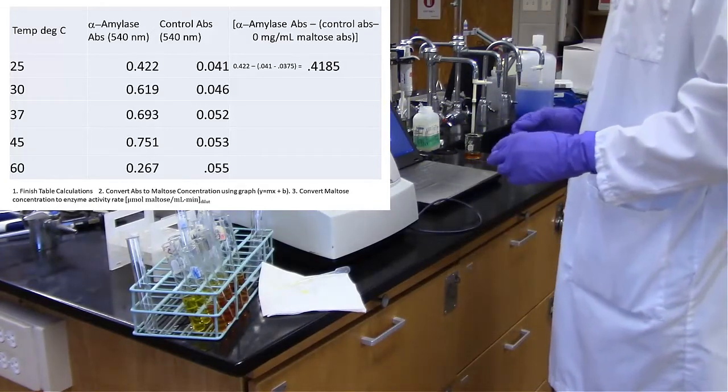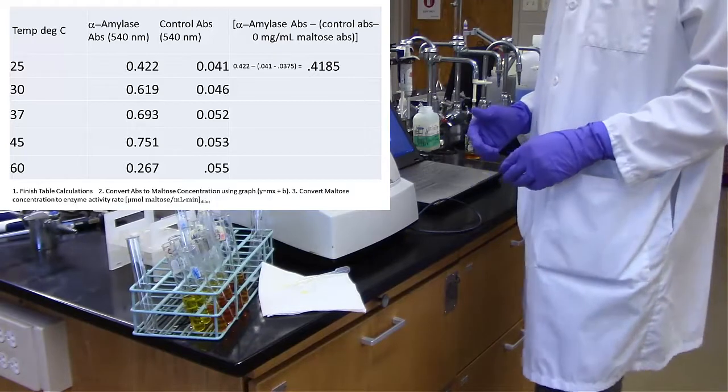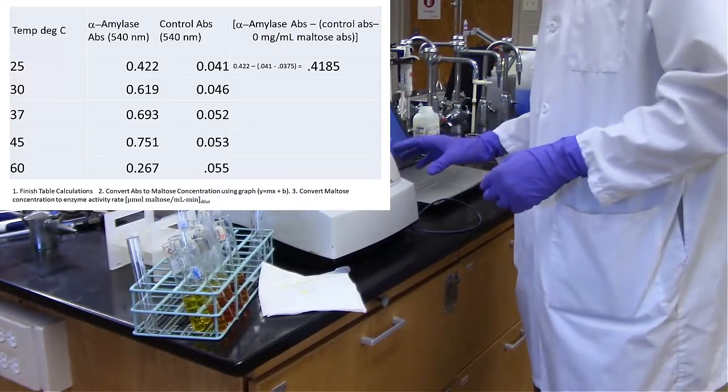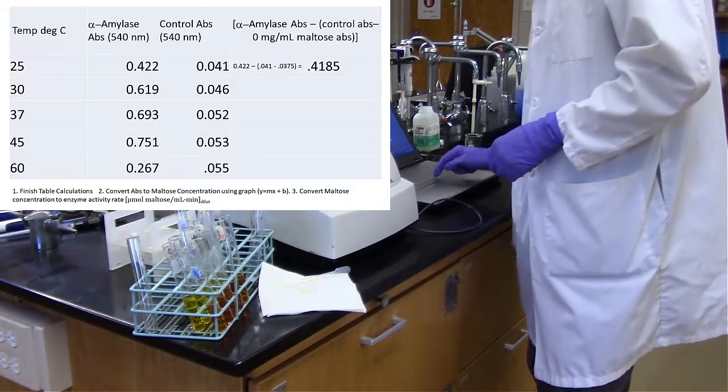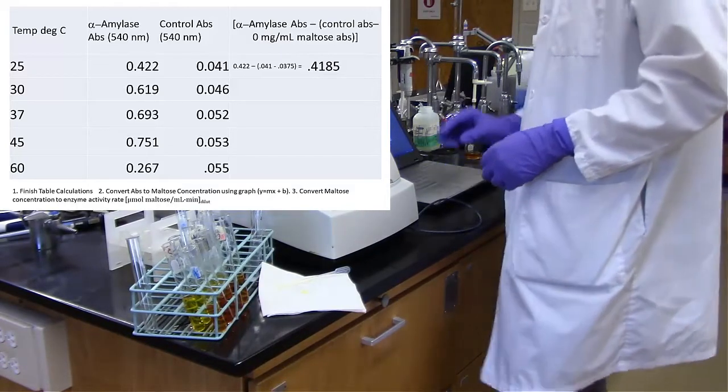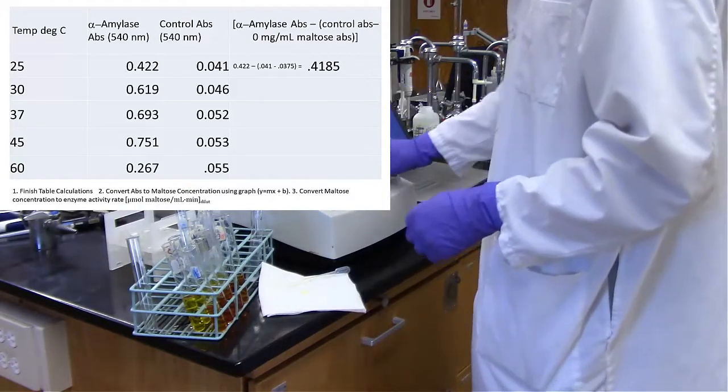So a little bit warmer than the mouth is actually the optimal temperature that alpha-amylase seems to function at based on this specific experiment. Again, I would have guessed probably a peak at 37. It's just going to be offset to 45 in this case.